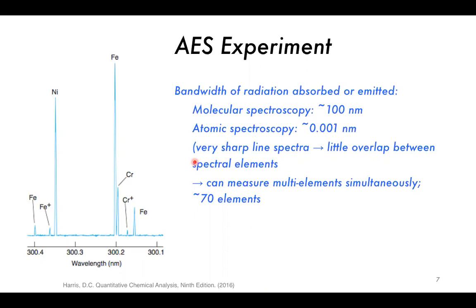So this is only possible for the emission spectroscopy because it doesn't use a light source. What's happening is we're just getting the emission from whatever is in the flame. So we're just looking at the flame, trying to remove any background caused by the light that comes from the flame.